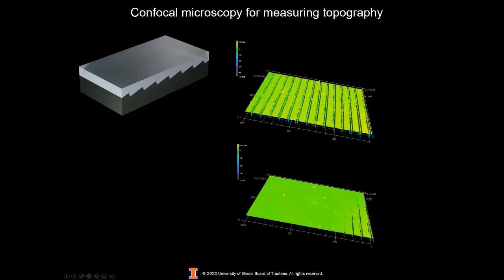This image, the top image, was made on the automated mode for our microscope, in which the software decides the range of illumination, the range of the Z stack that it takes, and all these parameters. If we operate in manual mode, then we can try to stick to the range in Z that only gets the top surface, but that doesn't work very well if you have a tilt on your sample, which is basically all the time.